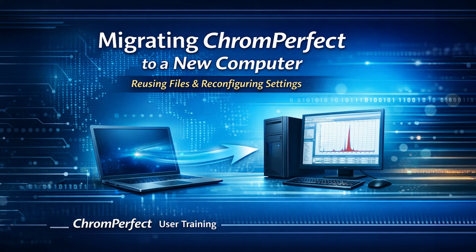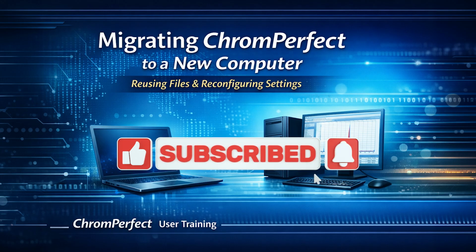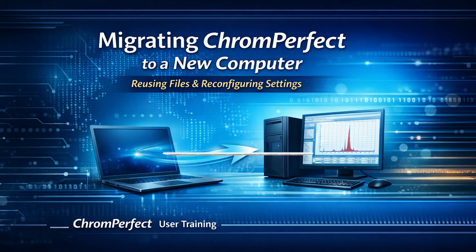In this video, we'll walk through how to install Chromperfect on replacement computer hardware and migrate an existing data acquisition system. We'll cover what files can be reused, what settings cannot be copied between machines, and the key configuration details you should capture from the old system before you begin.